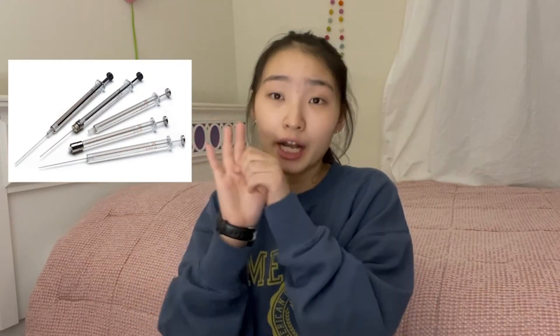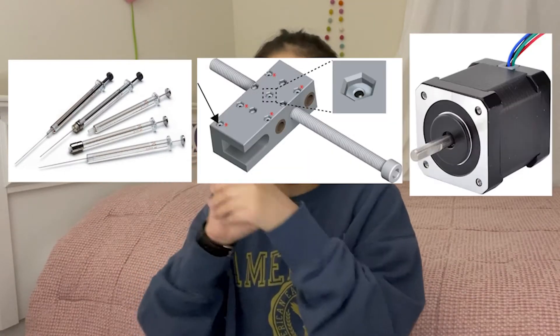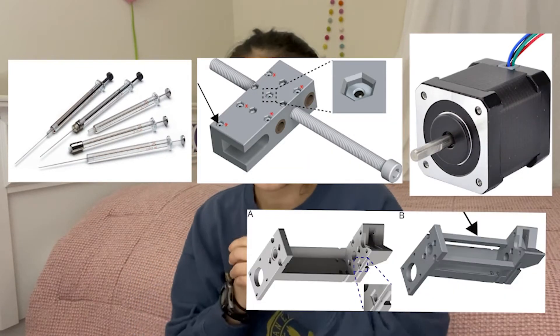But first, how does the FRESH extruder actually work? It consists of five main components: the syringe, the carriage, the lead screw, the stepper motor, and the core. The syringe serves two main roles: first, to store the bioink, and second, to deposit it using a plunger. This plunger is moved by a system consisting of the carriage, lead screw, and stepper motor.